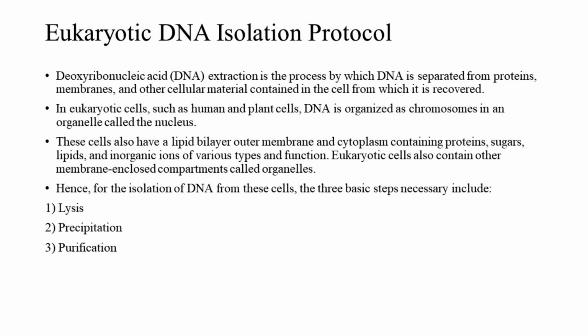Deoxyribonucleic acid, DNA, extraction is the process by which DNA is separated from proteins, membranes, and other cellular material contained in the cell from which it is recovered. In eukaryotic cells, such as human and plant cells, DNA is organized as chromosomes in an organelle called the nucleus.